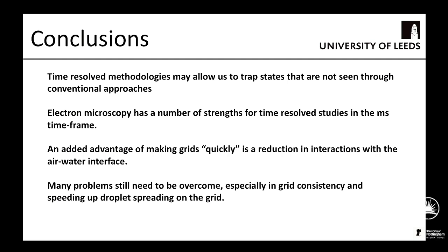There appears to be an advantage of making grids quickly, but this is still work in progress, very much so. It'd be interesting to see other systems and what their tomography looks like. And for some systems, I don't think it matters whether you're at the air-water interface. There's plenty of very beautiful 1.5 angstrom structures and 2 angstrom structures out there made on a Vitrobot. A lot of this is dependent on your sample. Some samples really like to be frozen, others don't. And this might be a means in which you can negate some of those problems.